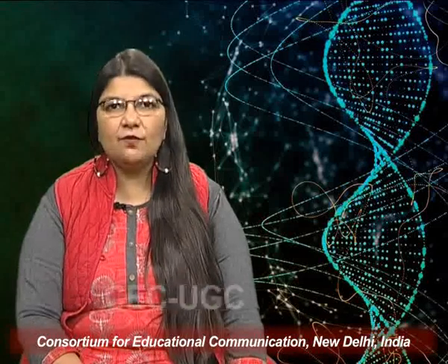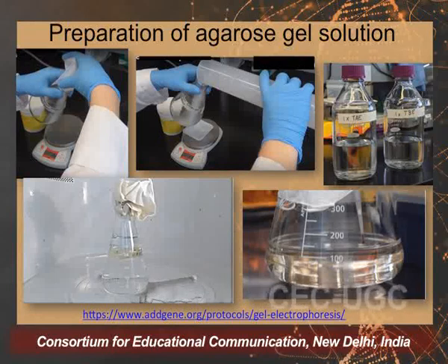So the first thing is to weigh the amount of agarose. Generally 0.8% to 1% agarose gel solutions are made to separate or visualize genomic DNA, plasmid DNA or restriction DNA fragments routinely. So, 0.8% to 1% agarose solution. The agarose is weighed and then dissolved in the buffer. We can use two kinds of buffer, TBE or TAE, which is Tris borate EDTA or Tris acetate EDTA. These are the buffers needed, and the gel needs to be made in these.